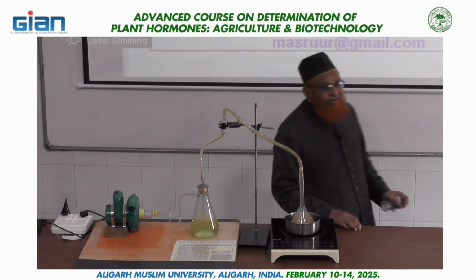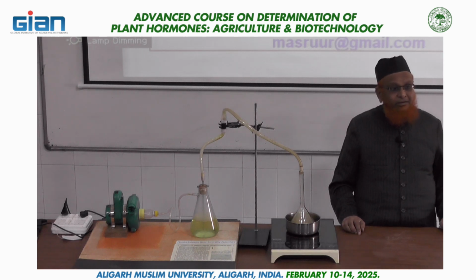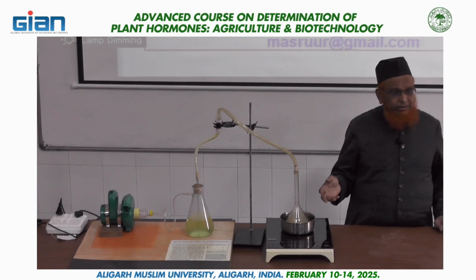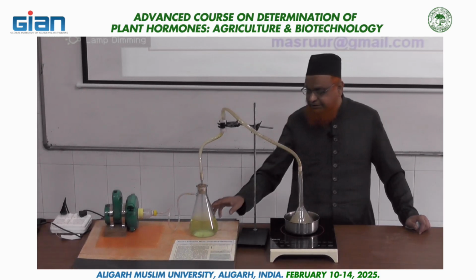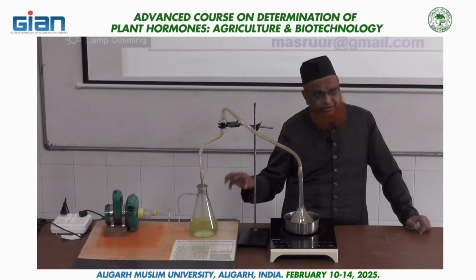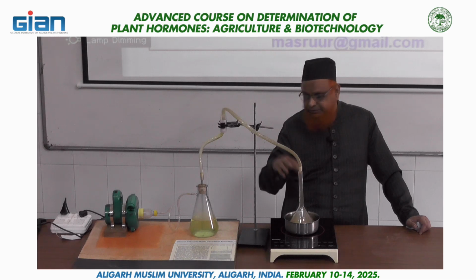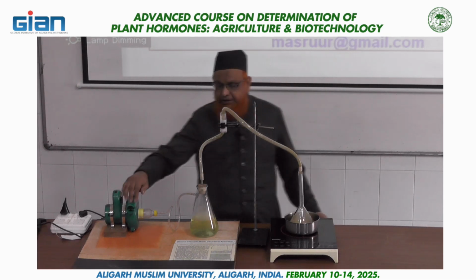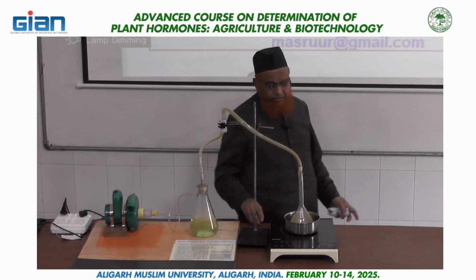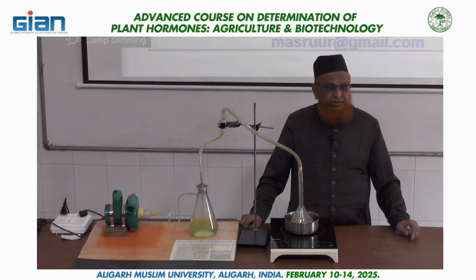What will happen? No more smoke will be dissolved in water if you increase the time, because the dissolving capacity of this water for the smoke is saturated. Okay, this will be wasted. All the extra smoke will be sucked and ejected from this outlet. So it will be useless to run the system after maximum optical density is achieved.